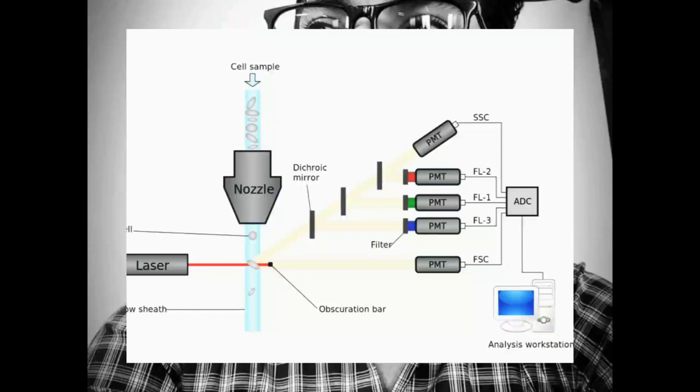So it is making some alterations and sending the beam that has been scattered forward from this particular cell to the PMT. PMT is the photomultiplier tube. Its function is transferring photons to electronic signals, and all go to the ADC, the analog to digital converter, and that digital content is shown on the computer.